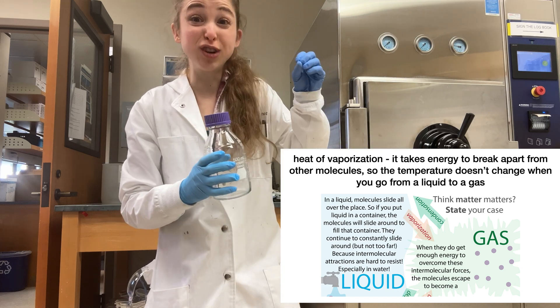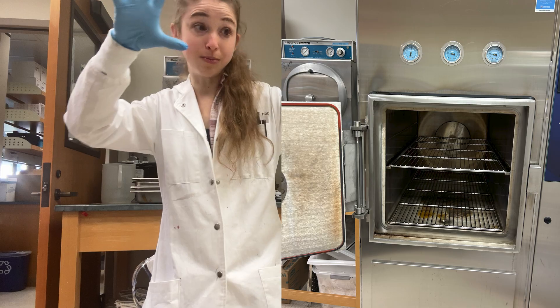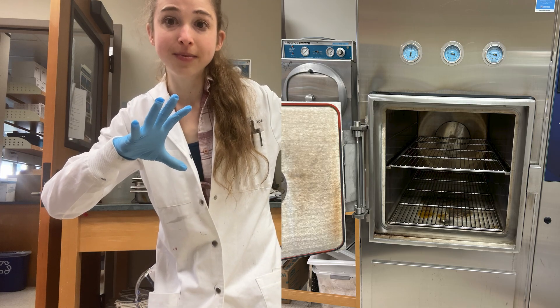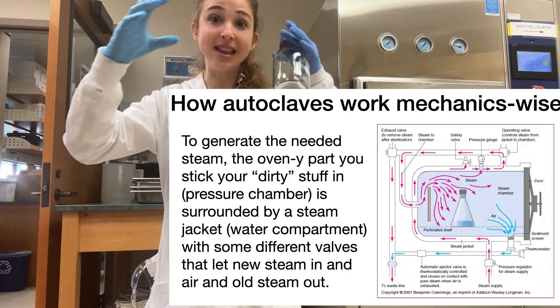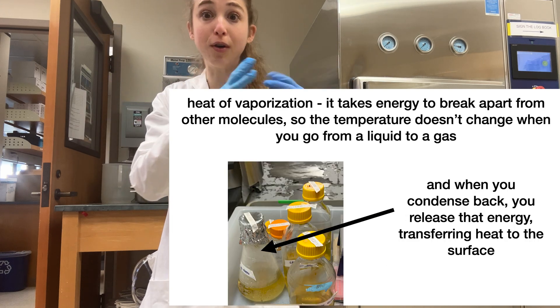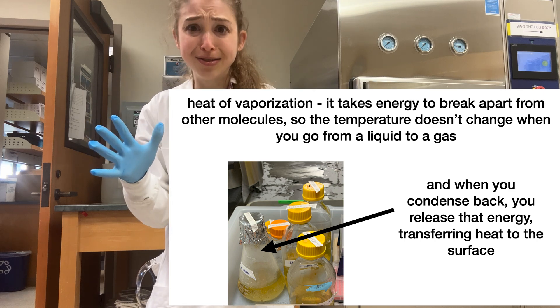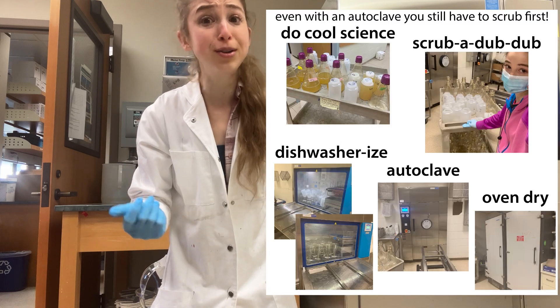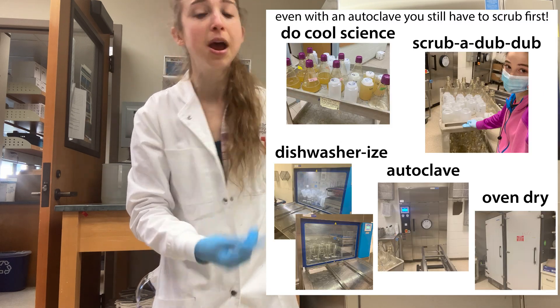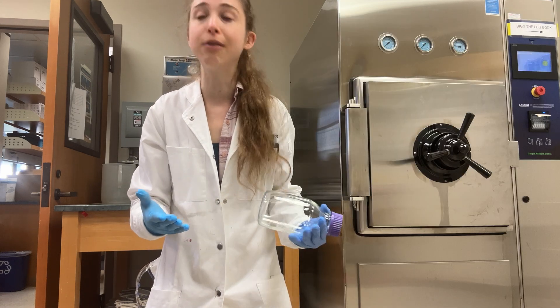So you have this really, really hot steam that's going to displace the air inside the chamber. Then that hot steam is going to come into contact with things and transfer all that heat energy to them, and kill anything living that was on those things. So it's not going to wash your dishes for you — you still have to do that washing beforehand — but then you stick things in here and it's going to sterilize them.